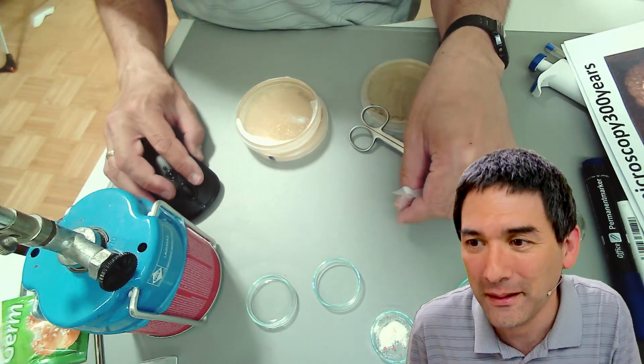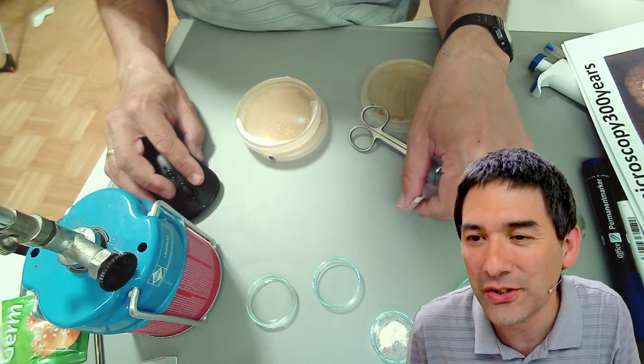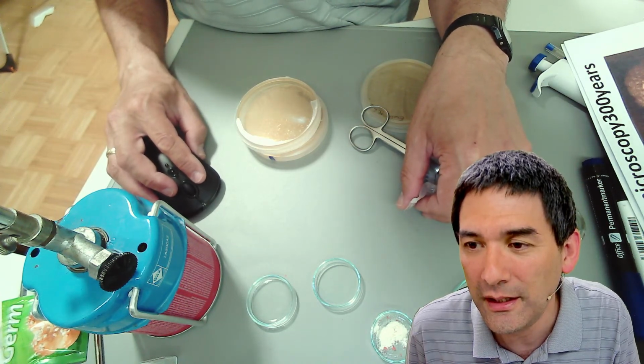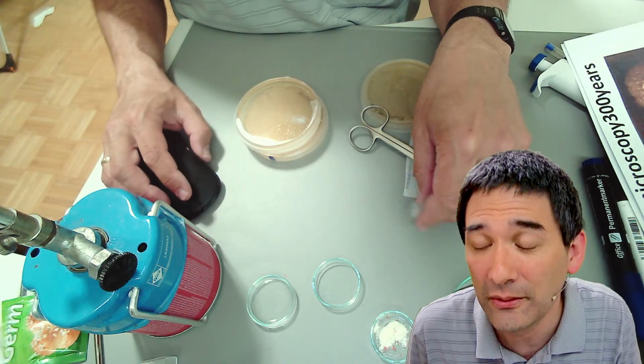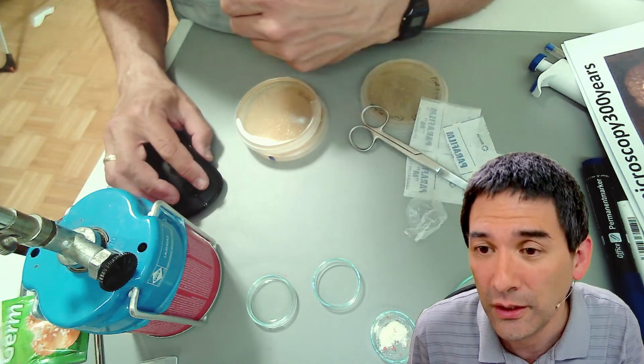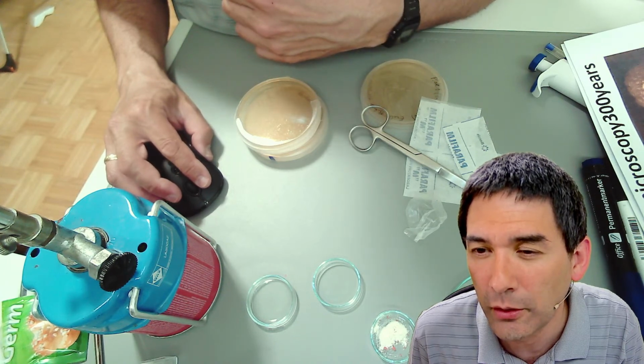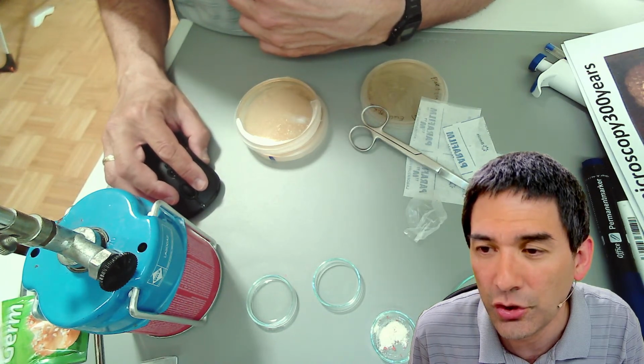Yeah. So the date, of course. Okay. Nice visible colonies. Thank you for the video. Somebody's saying, okay, thank you. What is the purpose of using parafilm? I just explained. I work in a microbiology lab, but I've never seen it on a Petri dish.